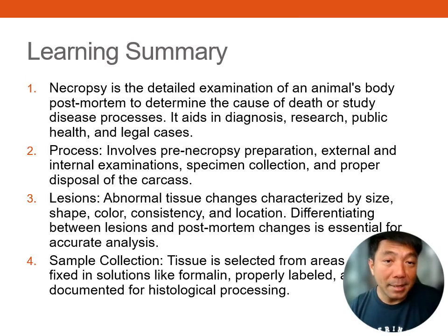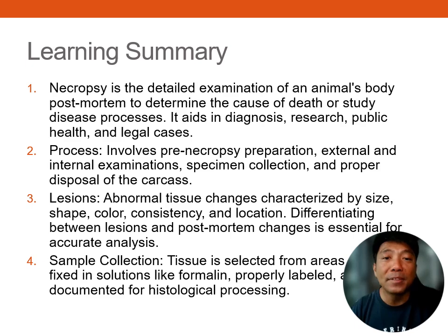To summarize, necropsy is an important procedure for understanding the cause of death and studying disease processes in animals. It involves a detailed examination of both the external and internal tissues.